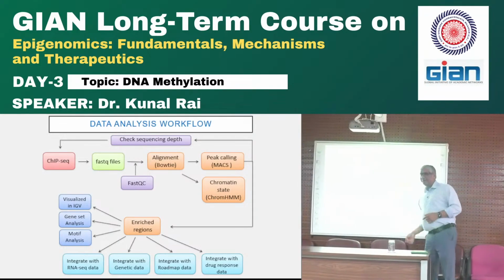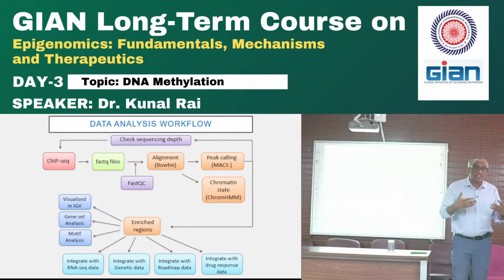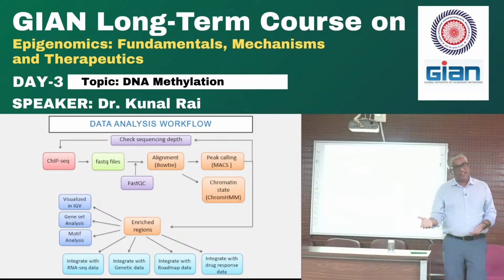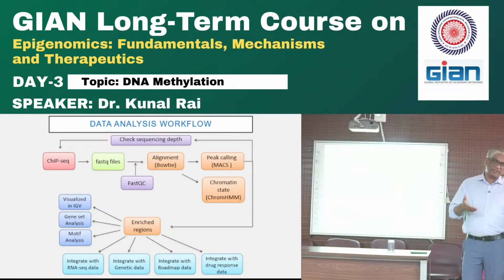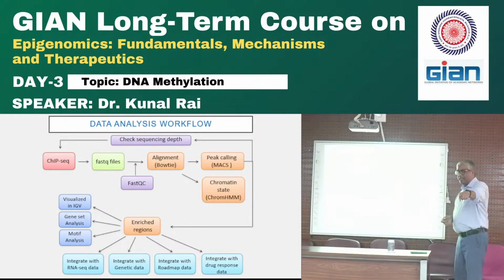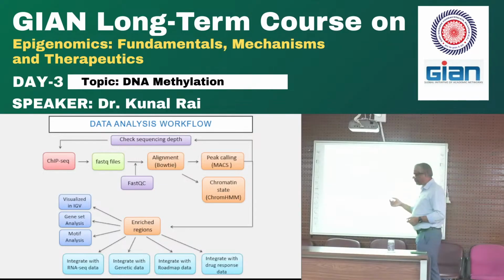So with Bowtie, you align your reads to the genome, to a reference genome. Fifty years down the line from today, most likely you'll align the reads to that person's own genome, because it'll be so cheap. Maybe not 50 years, maybe 10 years or less. Then I would have your sequence and I would have done ChIP-seq on your data and aligned to it for perfect matching. But the reference genome is good enough to do what we want to do.